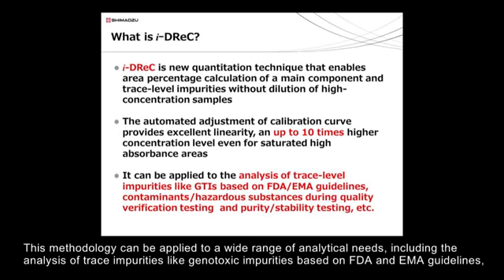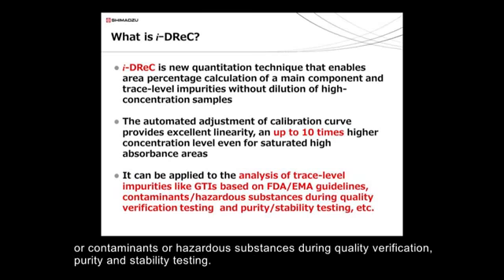This methodology can be applied to a wide range of analytical needs, including the analysis of trace impurities like genotoxic impurities based on FDA and EMA guidelines, or contaminants or hazardous substances during quality verification, purity, and stability testing.